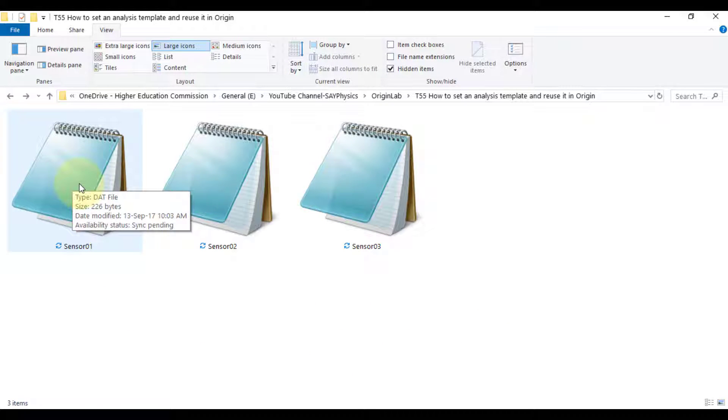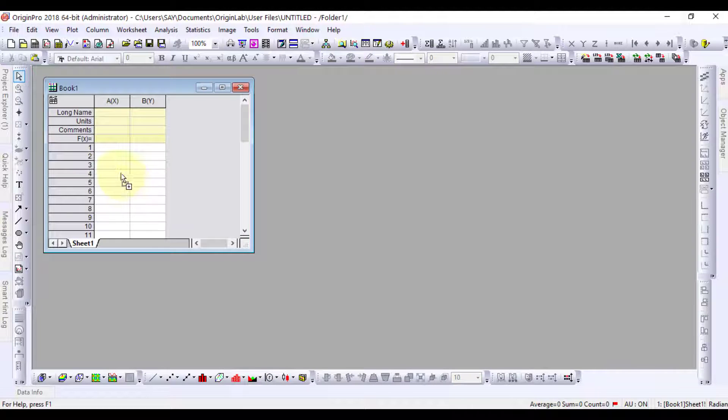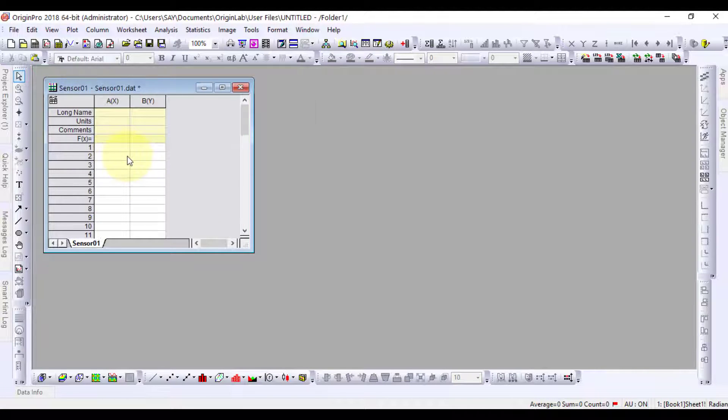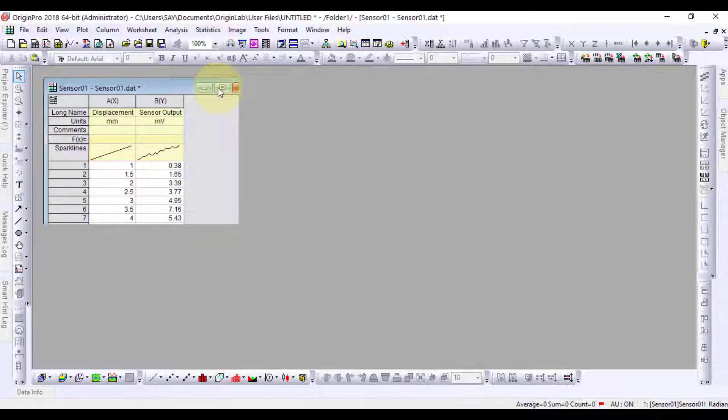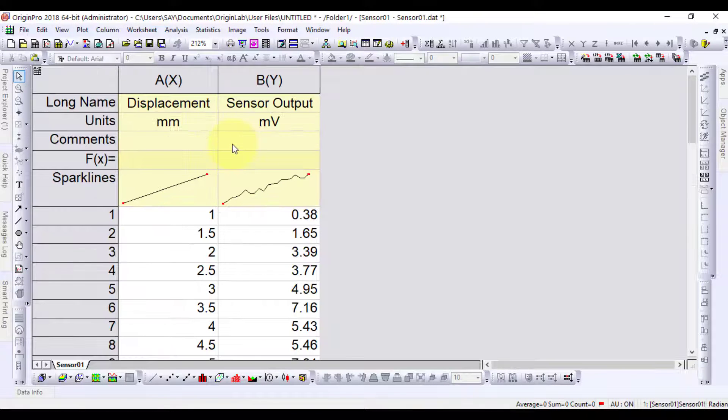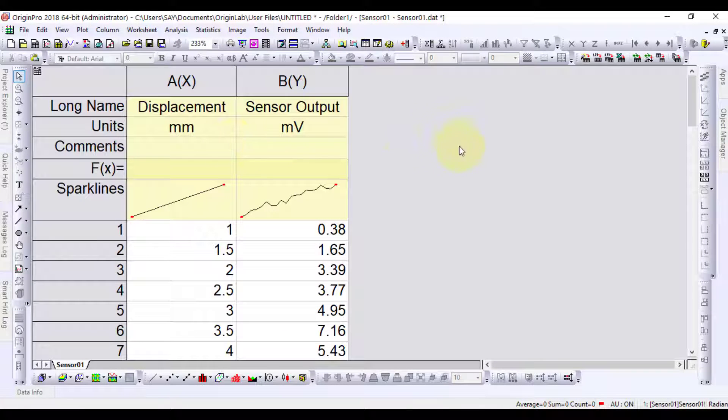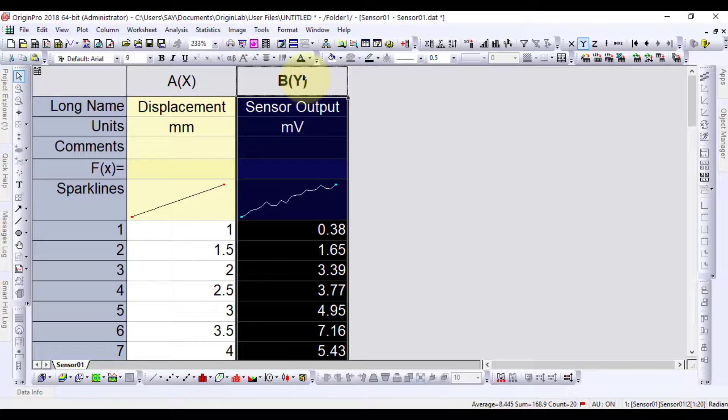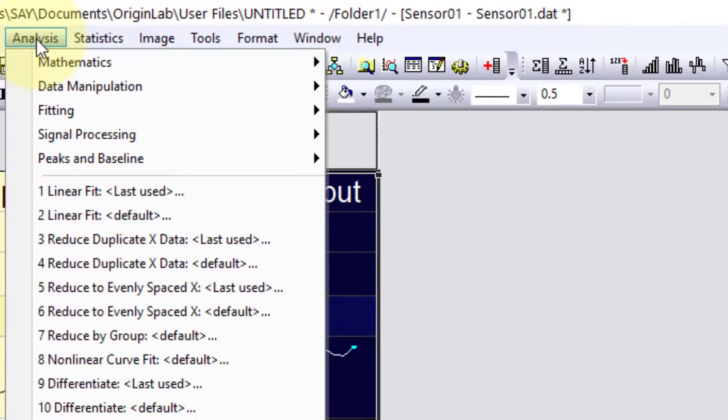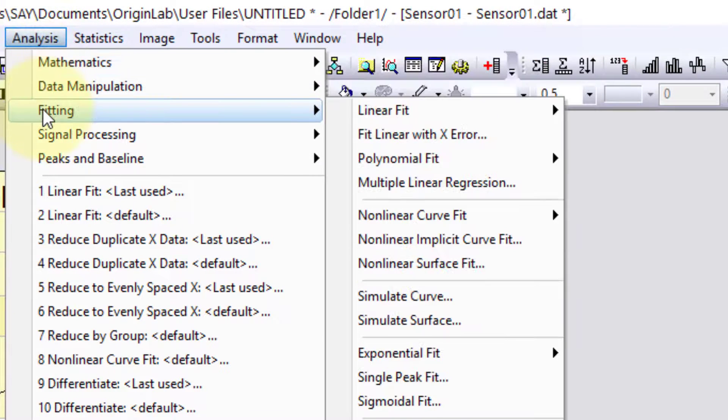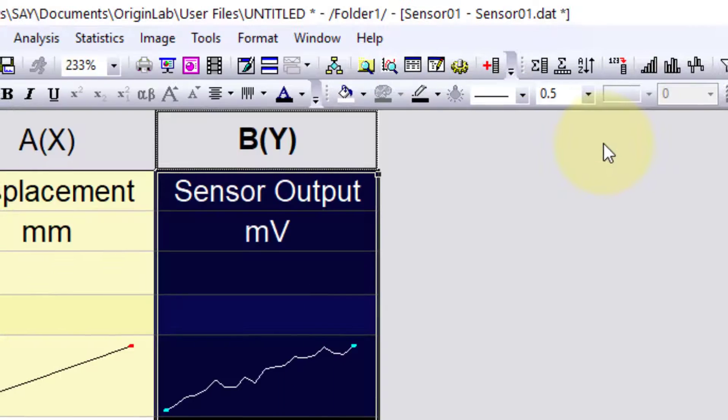Let's drag the data of sensor 1 into Origin. Select the data in column B. Go to Analysis, Fitting, Linear Fit and open the dialog.